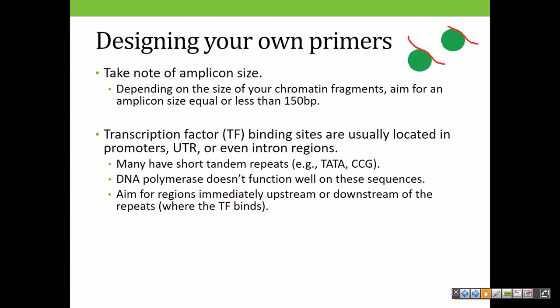Transcription factor binding sites are usually located either in promoters, UTRs, even in introns. In any case, many of them have short tandem repeats. It depends on the transcription factor. As you may or may not know, DNA polymerases don't like those. They tend to have slippage when there are a lot of repeats following each other.